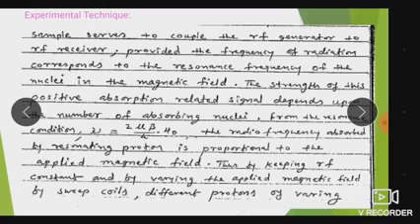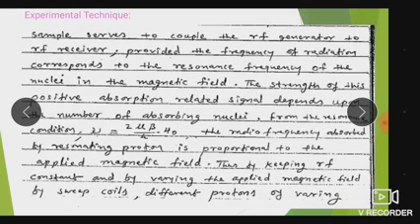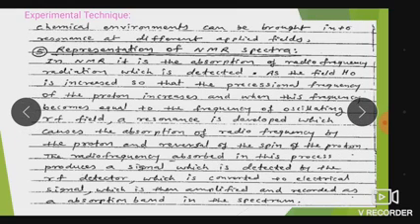So just by keeping RF constant and by varying the applied magnetic field by a sweep coil, different protons of varying chemical environments can be brought into resonance. To bring the protons into resonance, we require to change the field strength, and when varying the field strength we bring all the nuclei into resonance. The next topic is the representation of NMR spectra.